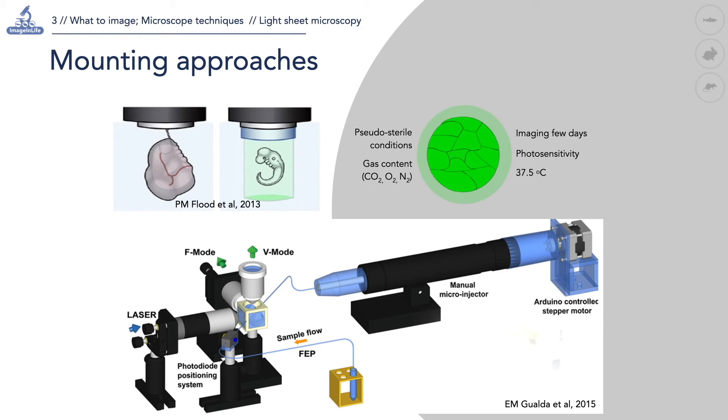They require a stable concentration of gas mix of oxygen, nitrogen and CO2, and a constant temperature around 37 degrees.